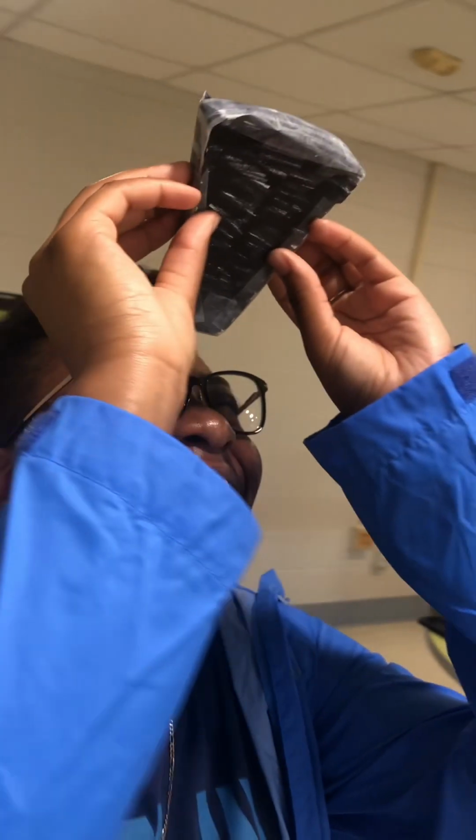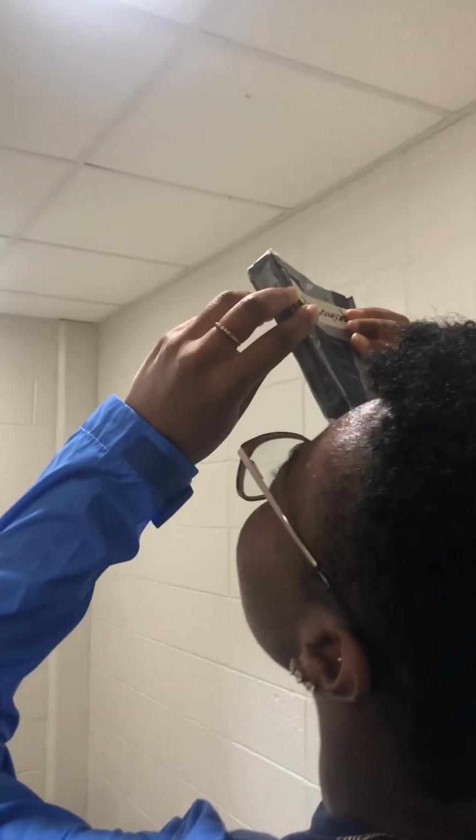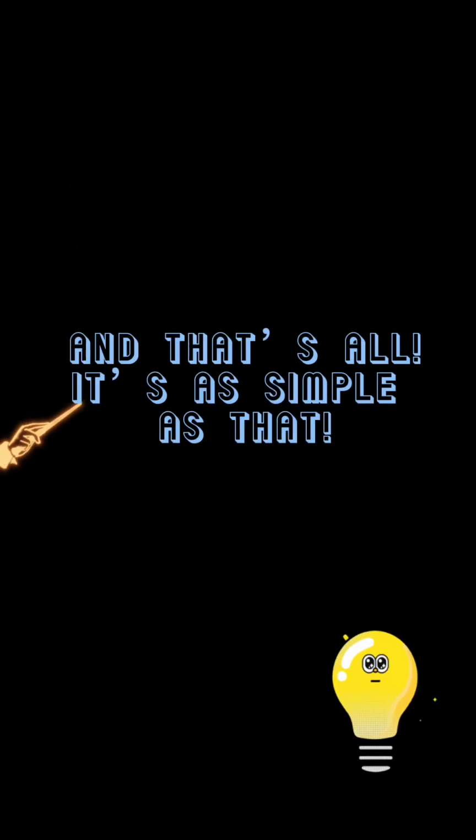Without moving the spectroscope, look to the left of the slit and you should see an illuminated scale like this one. If the scale appears to the right, you have the spectroscope upside down. While still looking at the scale, carefully rotate the eyepiece until you see a continuous spectrum within the scale.